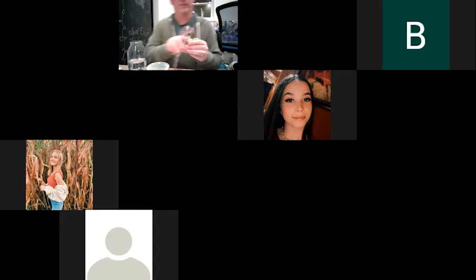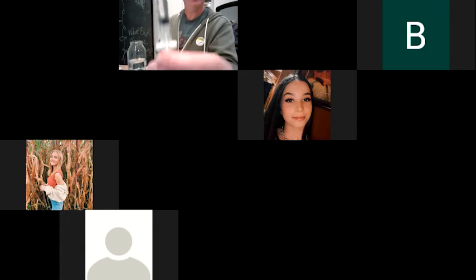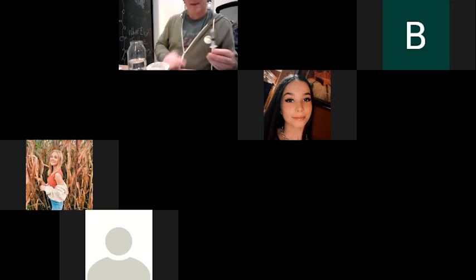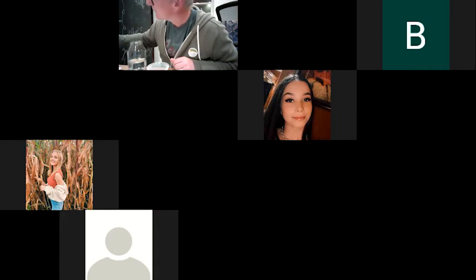Okay. Now we want to get it to the 2 mil mark. You can see now it's around 3. Push that till it gets to 2, and then we'll put that in the flask. So there are 2 lines here.